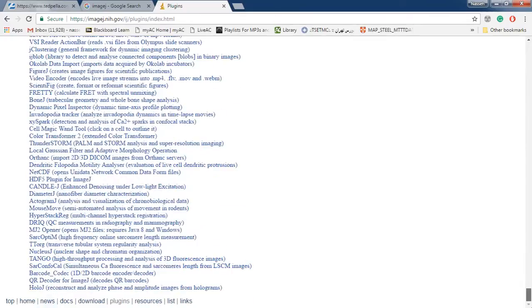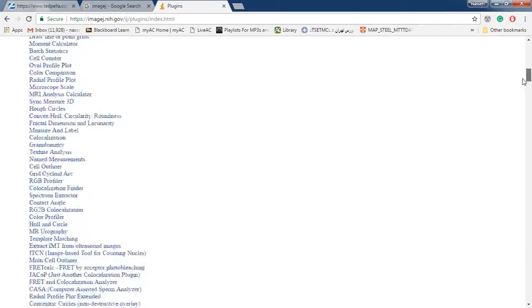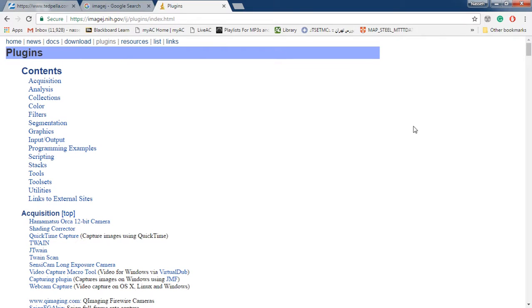And the cool thing about ImageJ is that it was written and made for doing medical image analysis. You look at your cell and do your analysis, or you look at an MRI picture and find out what that tumor is, for example. But because it's extendable, it can do many different things. You can do your image analysis of metallography pictures with it.